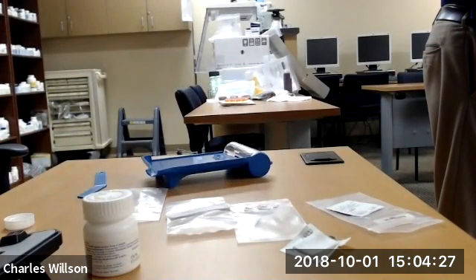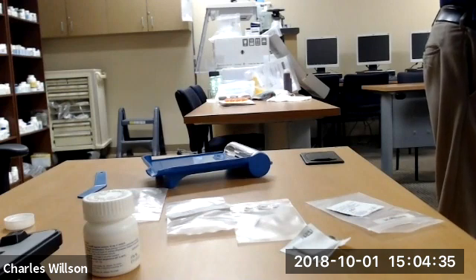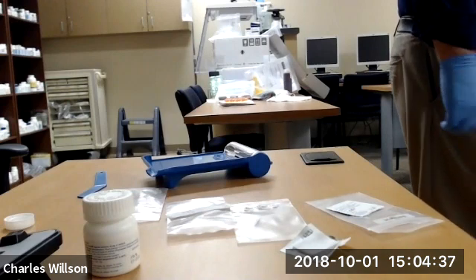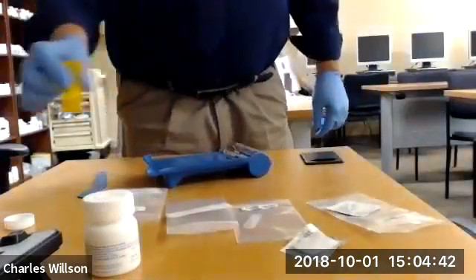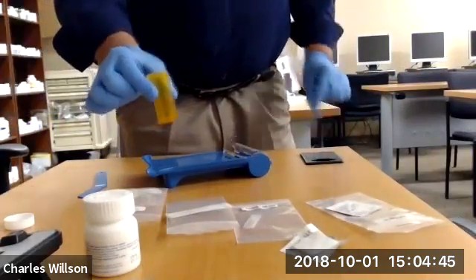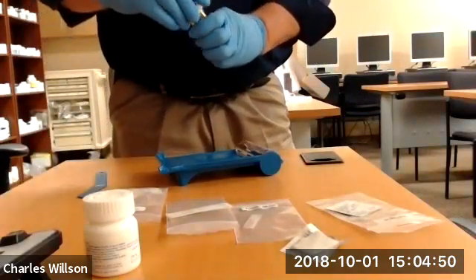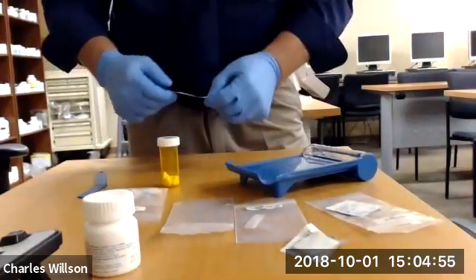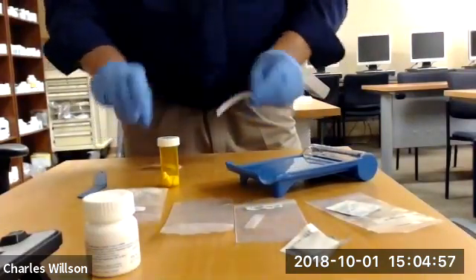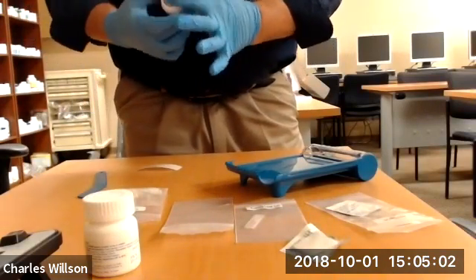All right. Put them back in. Put them into a container. Secure the container and put a label on it, and store in an appropriate place. All right. So here's your container, just out of sight. Okay. Here's your container. Boom. There. We did that. Okay. Lid. Okay. And label. Label what it is. We're going to put it out of the way. Okay.